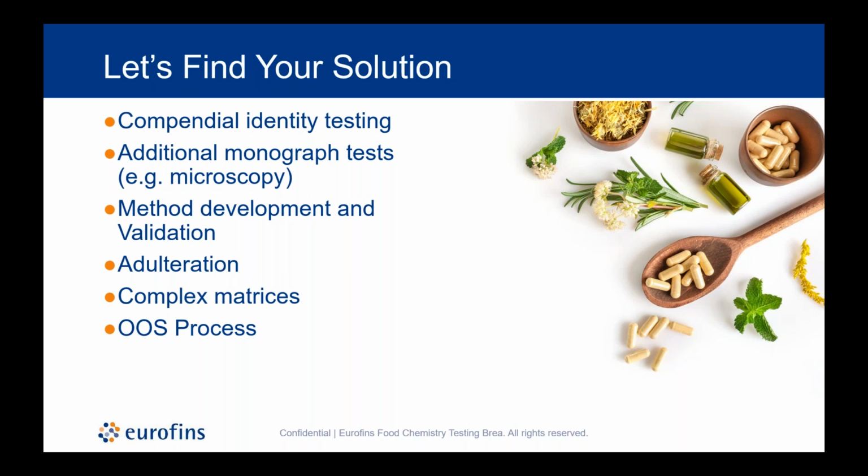And then if there is additional information or additional discussion of the process of how that material may be manufactured, we can potentially do development to either extend the scope of a method or develop an entirely new method, if it makes sense for a material that has been processed and altered outside of the standard accepted by the method.